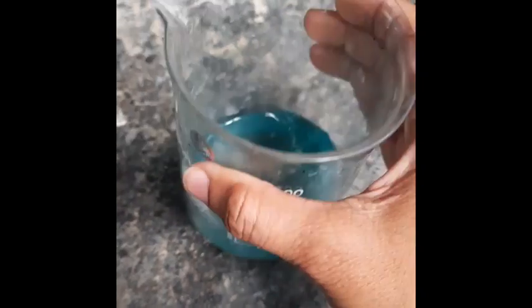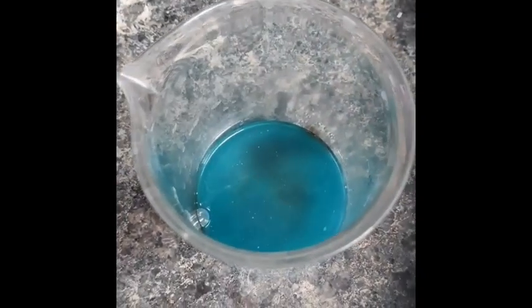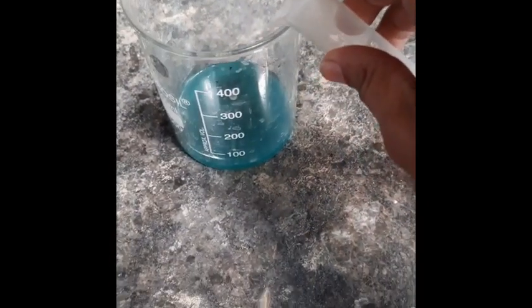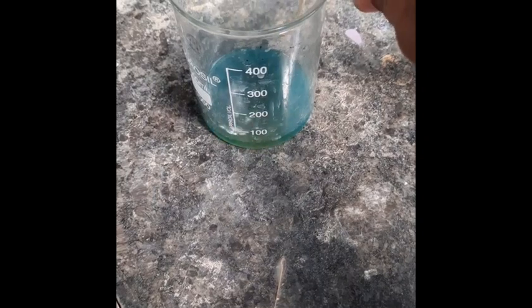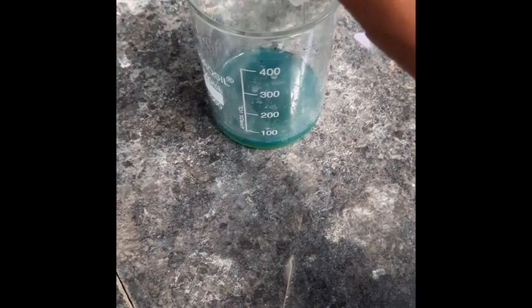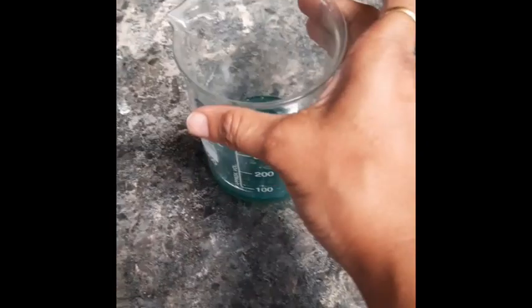Now the solution is completely cool. Now you have to add this 10 ml concentrated sulfuric acid. I am going to add it slowly. Slowly I am adding the concentrated sulfuric acid. See, white fumes are evolved here. Now keep it for heating for a few minutes.